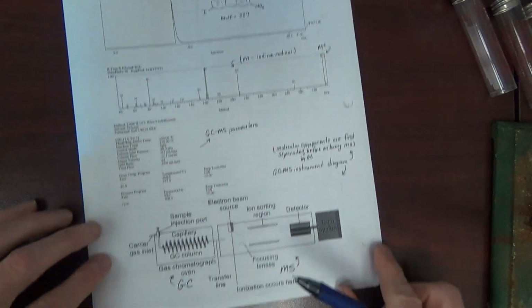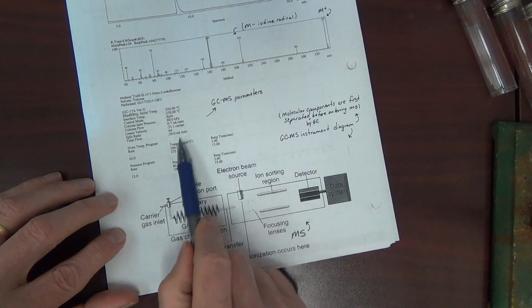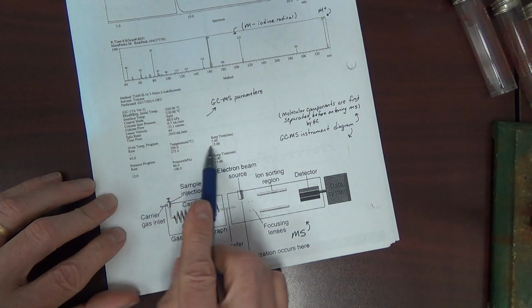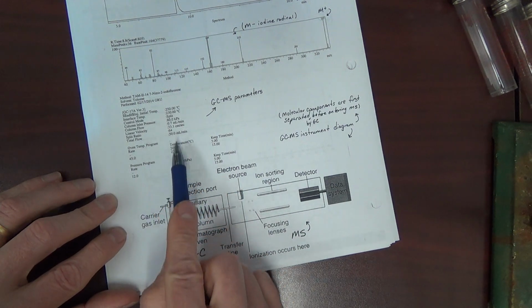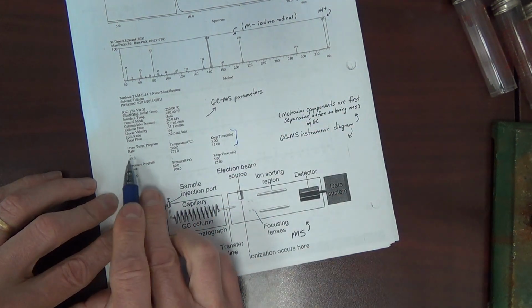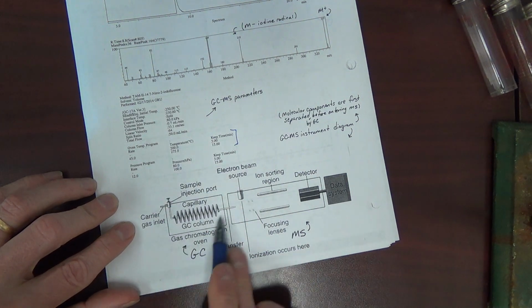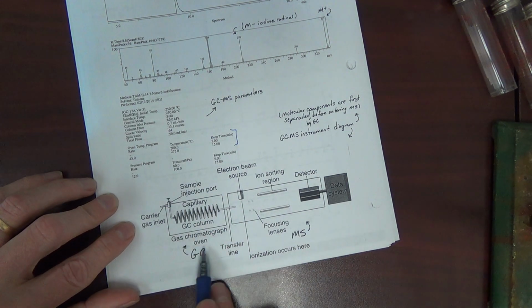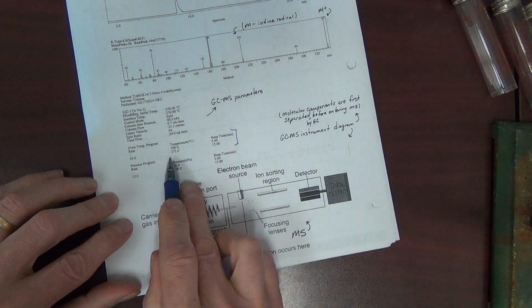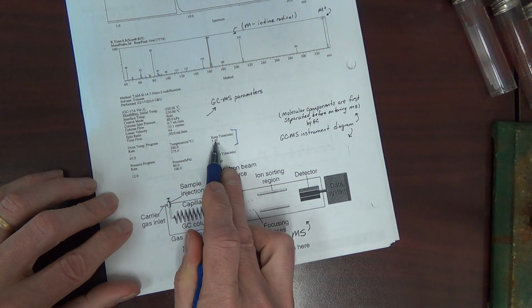While we're here, if you take advanced courses, you may run GC mass spec yourself. Parameters are very important. For example, flow rate on the column. Particularly here, I'll point this out. The GC portion is in an oven. It's heated, and you can vary the temperature. In this particular run, it started at 200 degrees. It stayed there for 5 minutes.